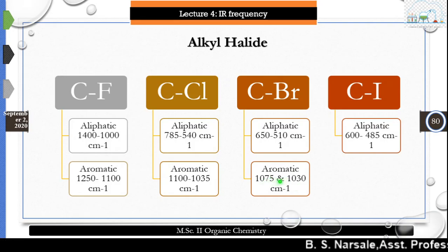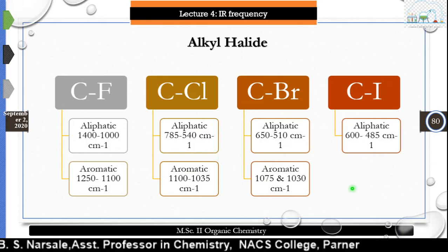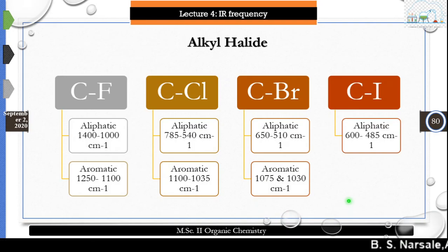Okay, these are all the different stretching frequencies that will be observed for the functional groups. We have just commented on the higher stretching frequencies of those functional groups. In the next lecture, we will look at the factors affecting these stretching frequencies.